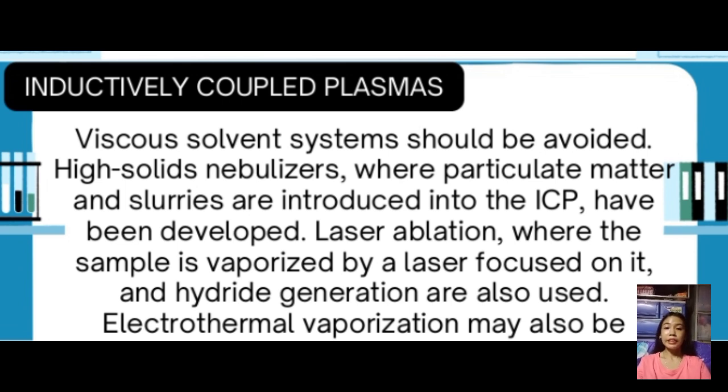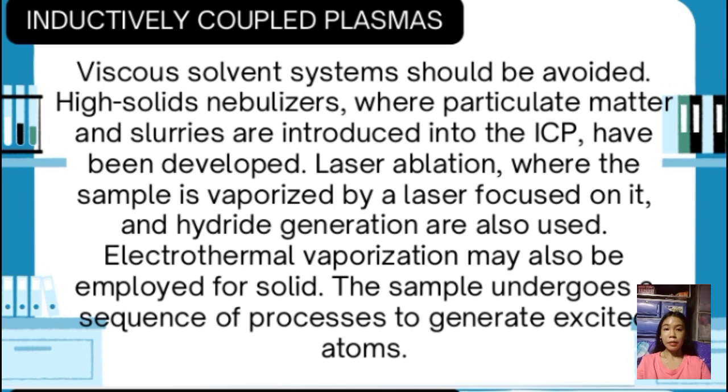Additionally, advancements in sample techniques have led to the development of high-solids nebulizers capable of introducing particulate matter and slurries directly into the ICP. This advancement enhances the versatility of the ICP for different types of samples.